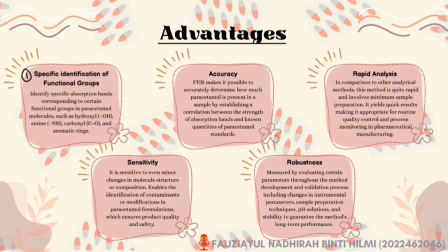First, we can get the specific identification of functional groups, which means we can identify the specific absorption bands corresponding to certain functional groups in the paracetamol molecule. For example, hydroxyl, amine, carbonyl, and aromatic rings. Next is accuracy. FTIR makes it possible to accurately determine how much paracetamol is present in the sample by establishing a correlation between the strength of the absorption band and known quantities of paracetamol standard.